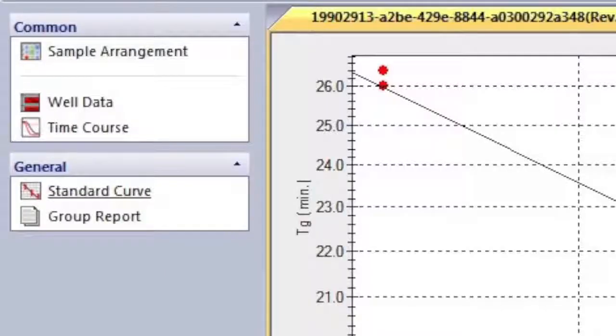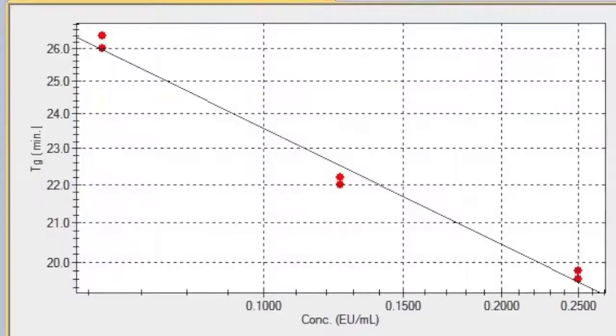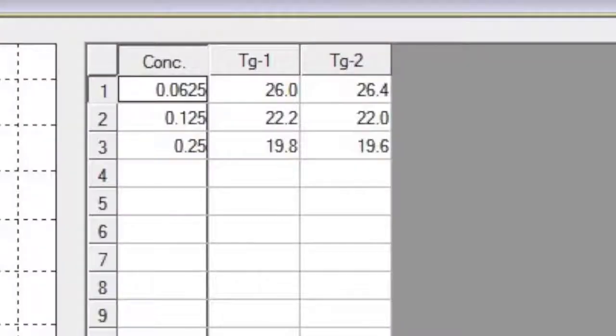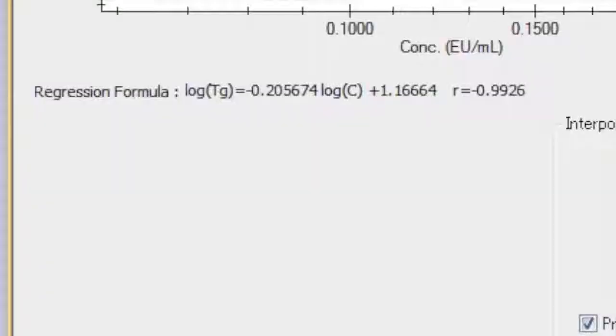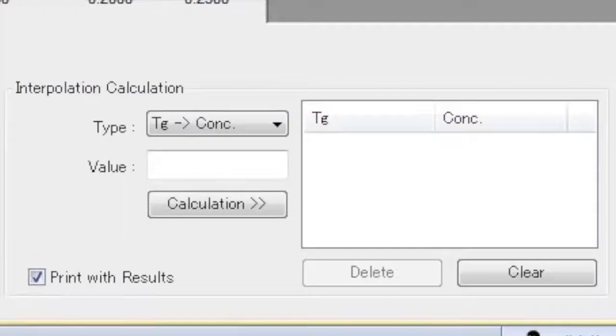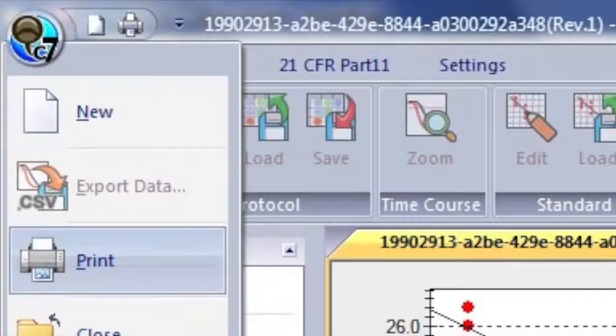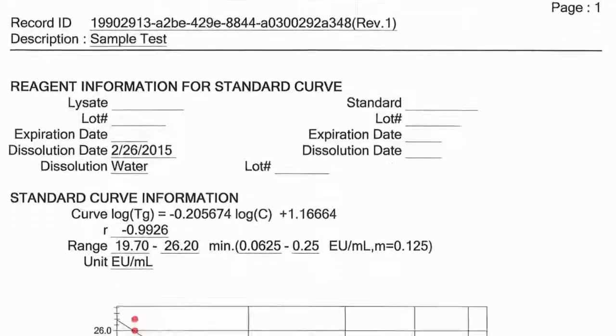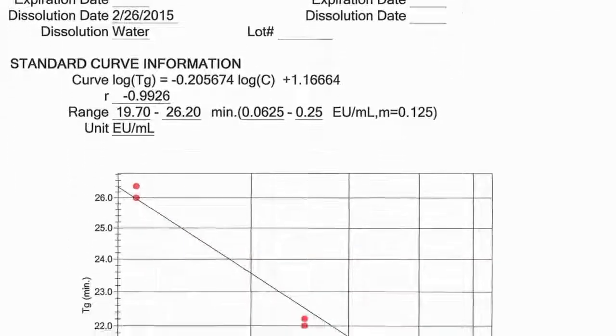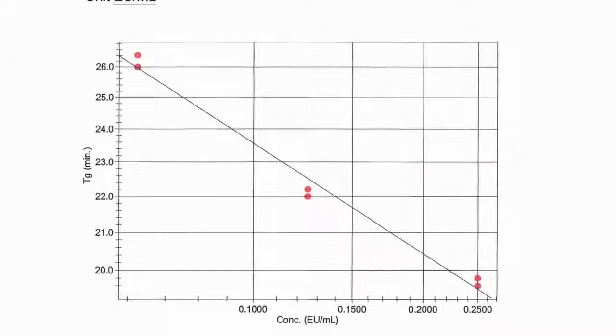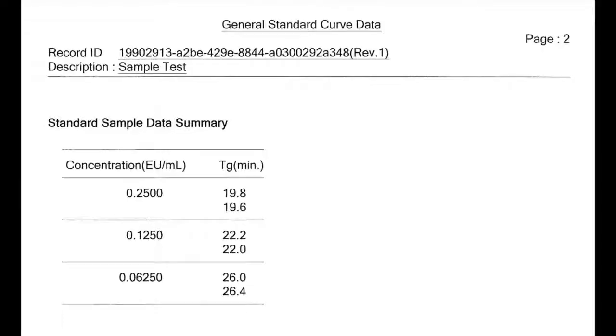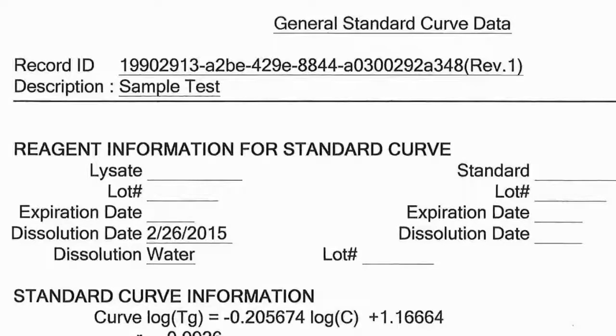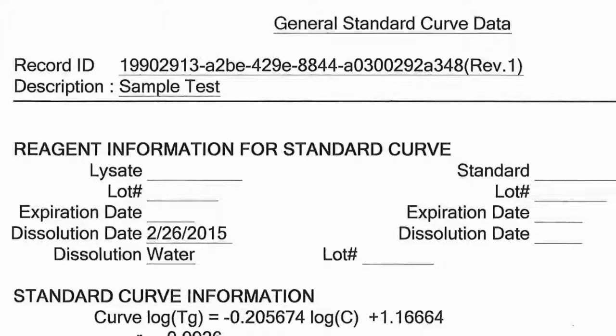By selecting Standard Curve, you are able to view the plot of your standards, see the standard curve created, calculate concentrations, and print the standard curve documents. All relevant standard curve information will be printed on two pages. If additional reagent information was added during the sample arrangement, you will now see that data within the standard curve printouts.